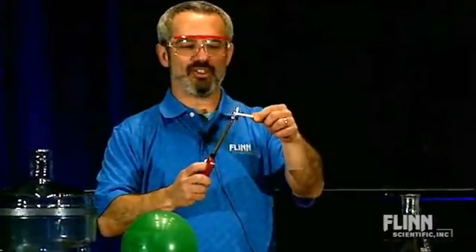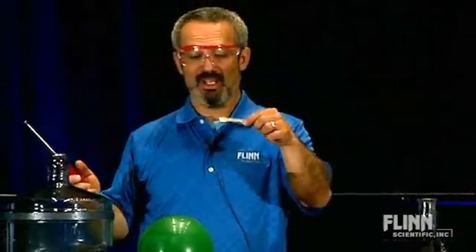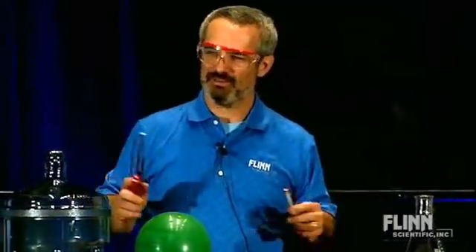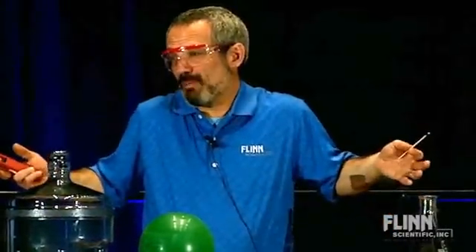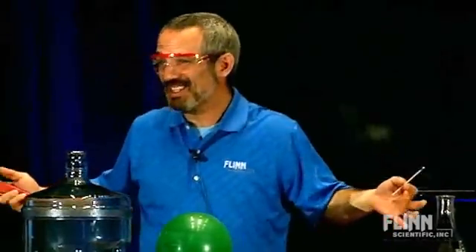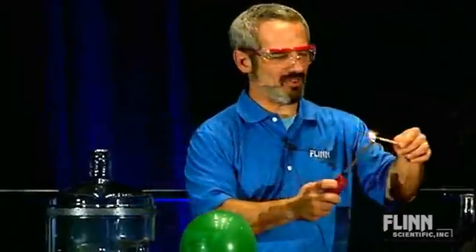When you see a wood splint burn, of course it's burning in oxygen. Well, things can burn in steam. Steam has more oxygen than air — air is 20% oxygen, while steam is 33% oxygen, and even more than that if you go by weight. So there's more oxygen available in there. Let's find out if it does.